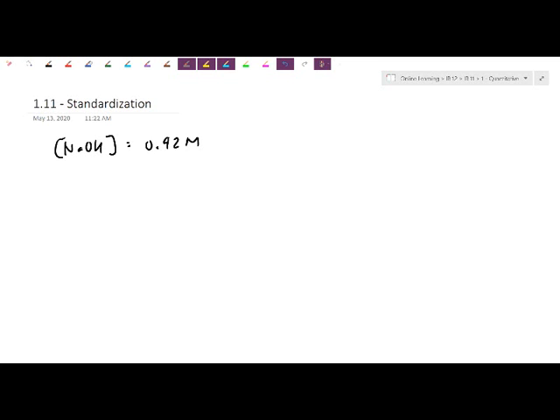And what we're doing here in part 2 of our titration is we're going to titrate NaOH against HCl. The HCl, what they told me so far, is going to be roughly 0.1 molar. Again, if you just took the NaOH solution straight and actually reacted it with HCl, because the NaOH is almost 9 times, 10 times stronger than HCl, it's not going to take much and the pink color will slowly appear.